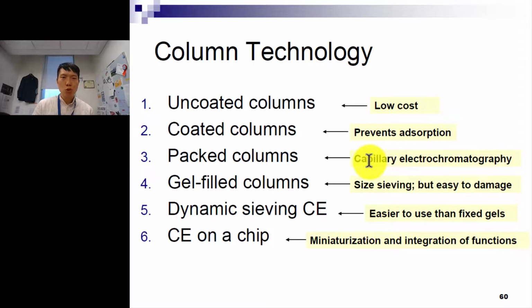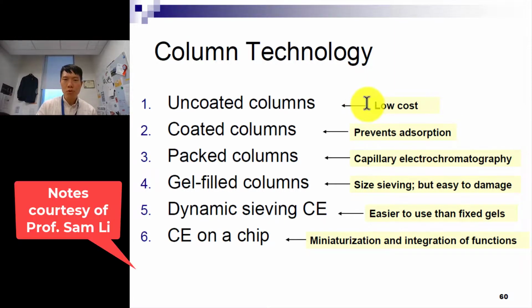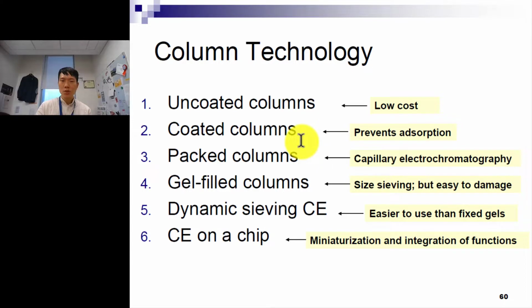So next part, we'll go on to the column technology here, where I'll give you a brief overview. First, what are uncoated columns, and why we use them: pretty much because of low cost. Coated columns are used with a higher cost associated and time, but that's done because of the prevention of adsorption of the molecules here. Once it adsorbs, it gets stuck, you create an imbalanced kind of cavity, and also you can't separate your substrate.